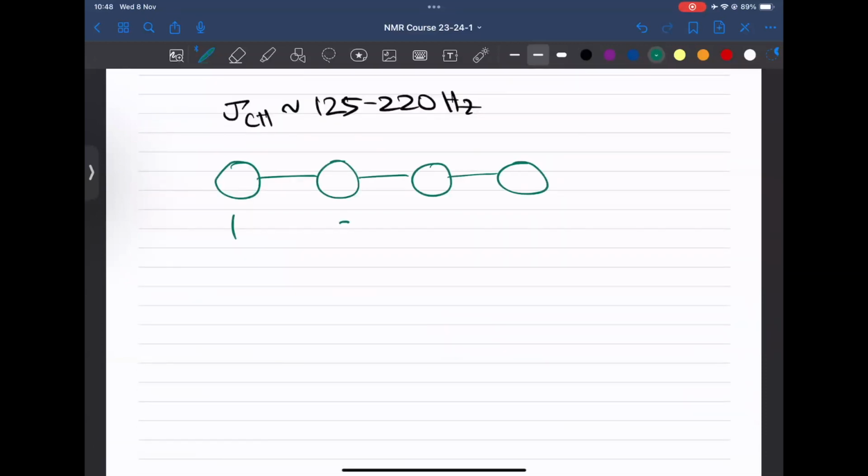So let's say this is the first residue, second residue, third residue, and fourth residue. Remember, when you acquire an HSQC, which residue each resonance belongs to is not known. You only see a signature, how it looks, but you do not know which peak belongs to the third residue, fifth residue, 50th residue, and so on. We need to find that. How we find that is this entire idea here.